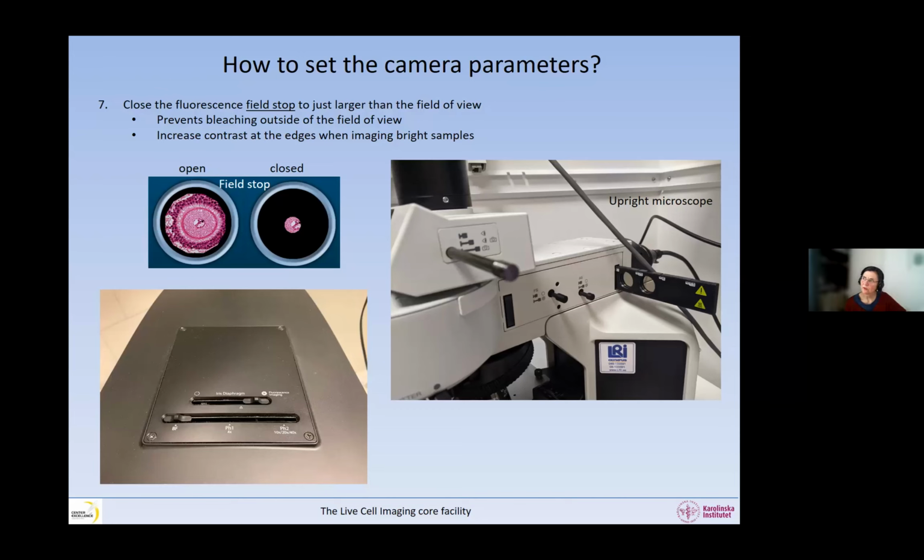If you oversample with the 100x objective, I don't think so, because the magnification depends also on the numerical aperture. So the magnification plays a big role in the brightness, and if something is dim, then you have more contribution of the shot noise, right? So the brighter the better when it comes to signal to noise ratio.